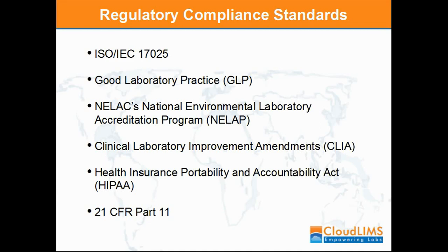HIPAA, the Health Insurance Portability and Accountability Act, sets the standard for sensitive patient data protection. Companies that deal with protected health information must have physical, network, and process security measures in place and follow them to ensure HIPAA compliance. Let's consider how LIMS helps follow HIPAA compliance.